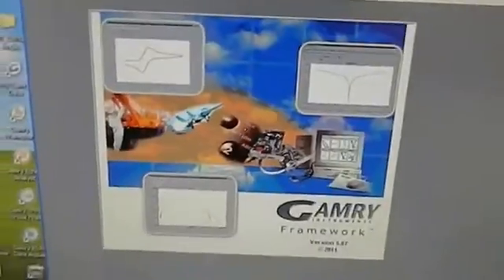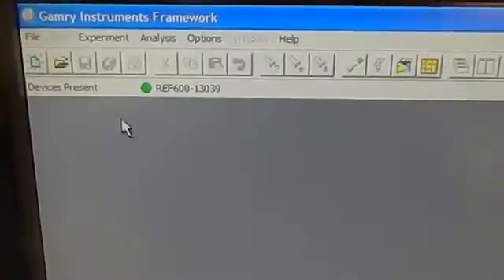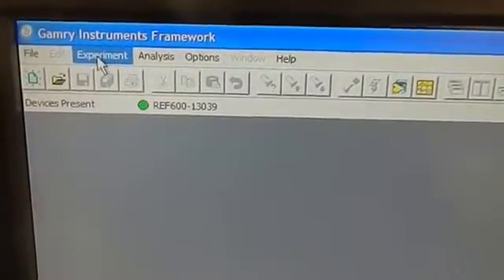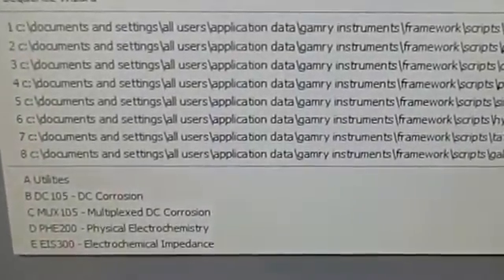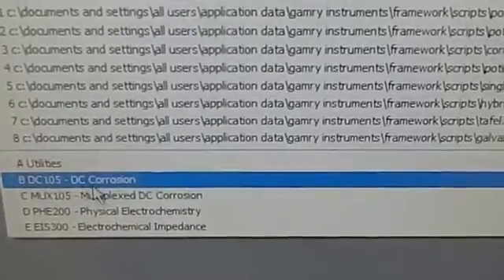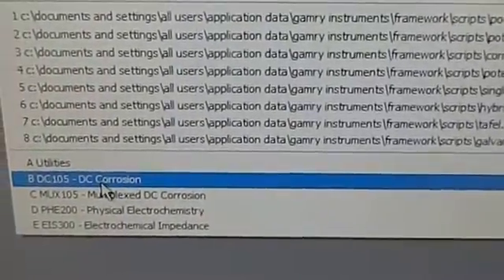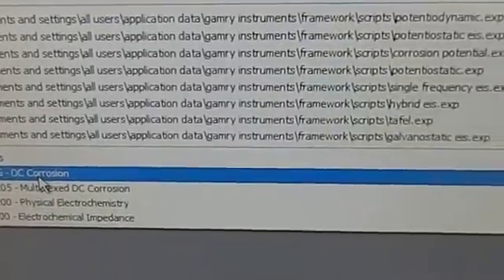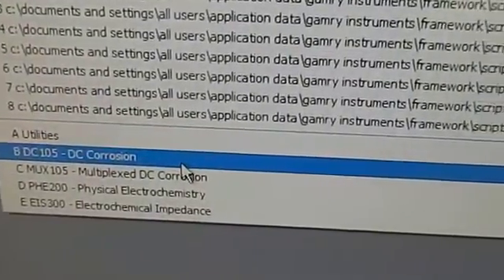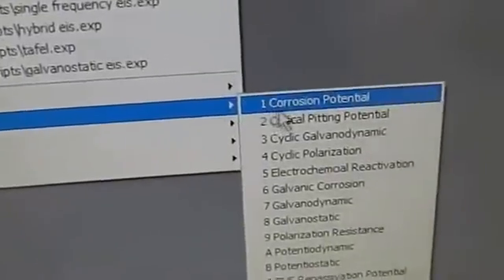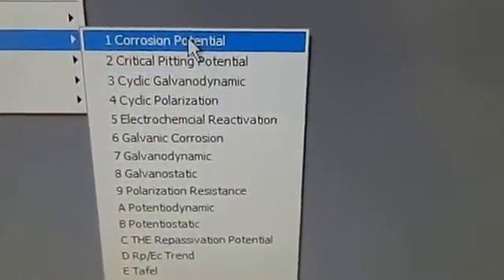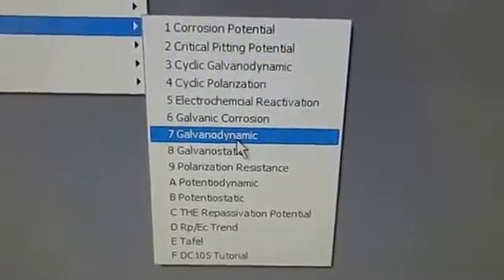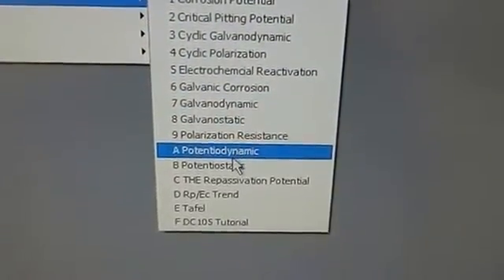The GAMRI Framework pops up. To run the experiment, we have to go to the Experiment menu. Click here and you will find some options in the dropdown. To run the Tafel curve, you have to choose DC 105. And from DC 105, go down and choose Potential Dynamics. Now the window pops up and it needs some values.